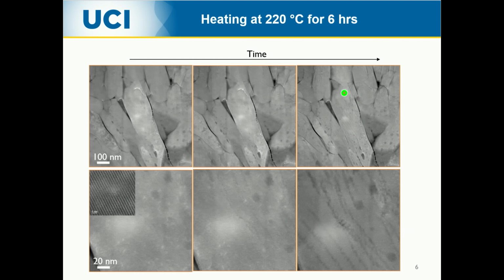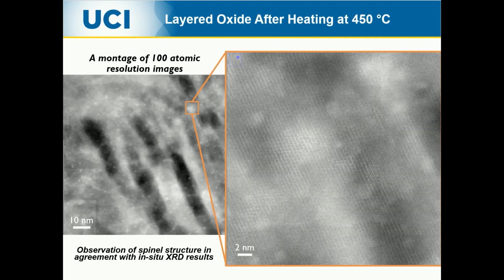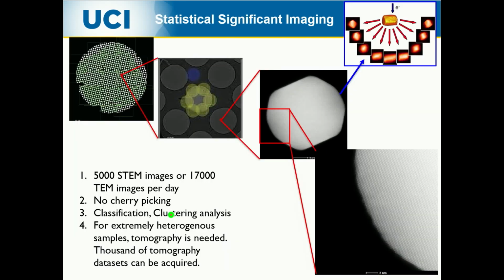And looking at how, when you heat this material, you use temperature to actually trigger oxygen loss and the forming of these voids because of lithium oxide vacancies, right? So what's more exciting is that now we can automatically take those images at this length scale, which is 100 nanometer by 100 nanometer. To us, this is a large area, isn't it? Because for us to get atomic resolution images, we need at least 100 of them, right? So this is something that we really need to break the barrier for, right?